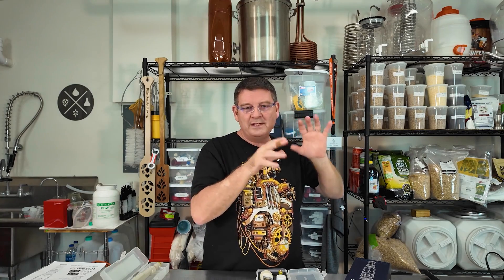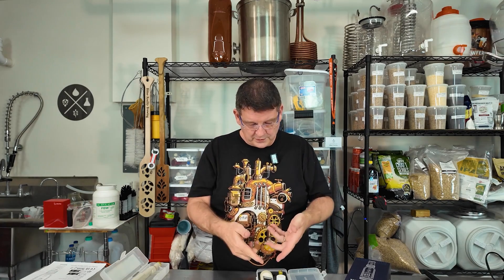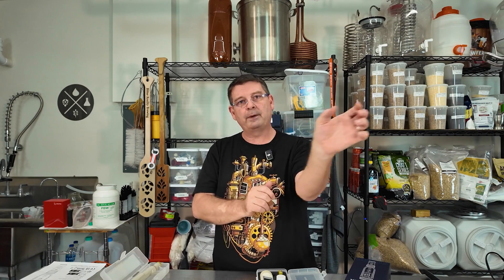That's going to save me a lot of time when I'm calibrating things because I'm looking to do a lot more kettle sours this year. My son's already going, okay, make this, don't add this, add this, do this flavor — and I'm like, okay, just give me some time. You have measure the pH value in your solution of course. You have your solution temperature. You have data hold, which you need — especially for me because I'm taking photos of stuff. So you hit hold, you look at it, you go, yep, okay, everybody's good. Especially when you're brewing with friends and things like that.